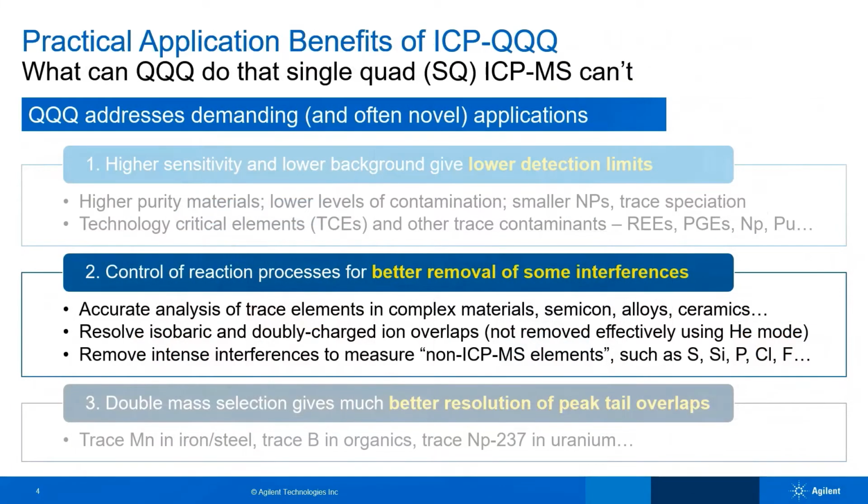Moving on to the control of reaction processes to give us better removal of interferences using reaction mode.